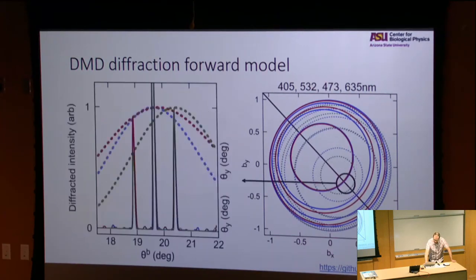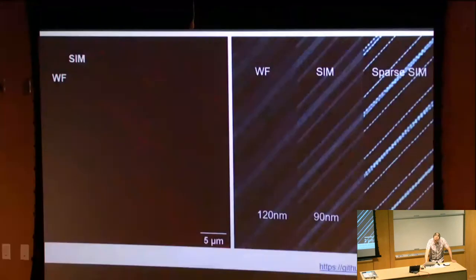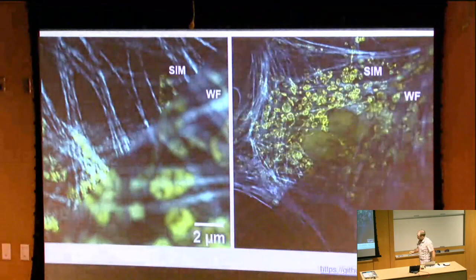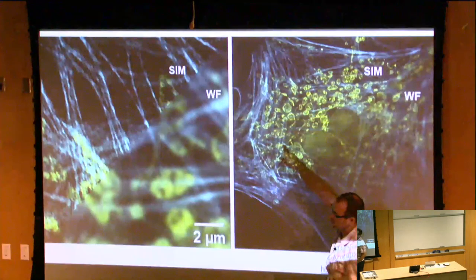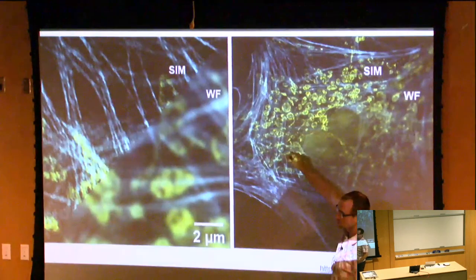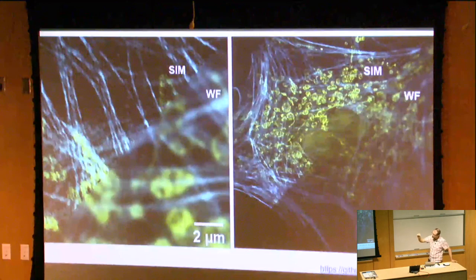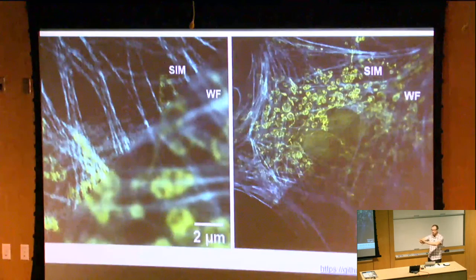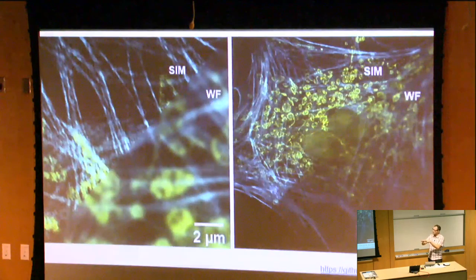For the SIM, not that much goes wrong, because what we're asking in this case is whether we can see what the interaction of these junctions is. So this isn't really monodisperse in that case, right? For the thing where we're trying to localize the individual RNA, as they start to overlap more, we don't know what they are. So either we throw that away, or we have to start writing inference models that say what we think two co-localized spots are going to look like on the camera when we see them.